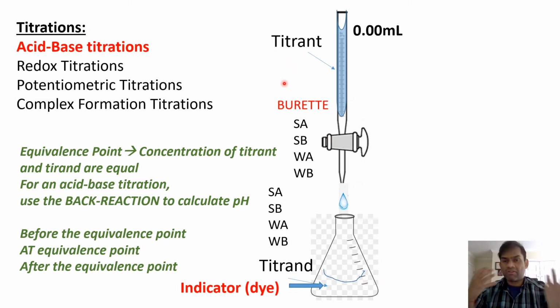The burette is not really accurate, so I usually tell students you can go kind of fast because you're not really looking to get exactly 0.50 mils or 0.20 mils, whatever increment you're adding. So we read it to 2 decimal places. That's the only important thing for the volume readings of the titrant, housed in a burette. The titrand just sits there, okay, it sits in the flask.